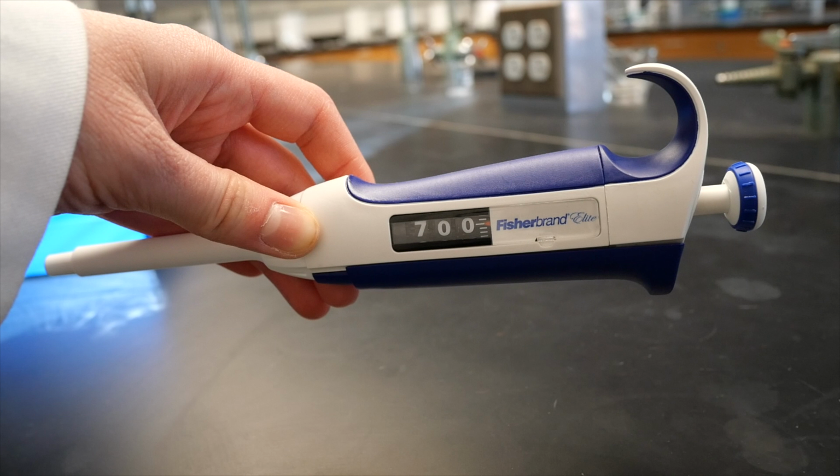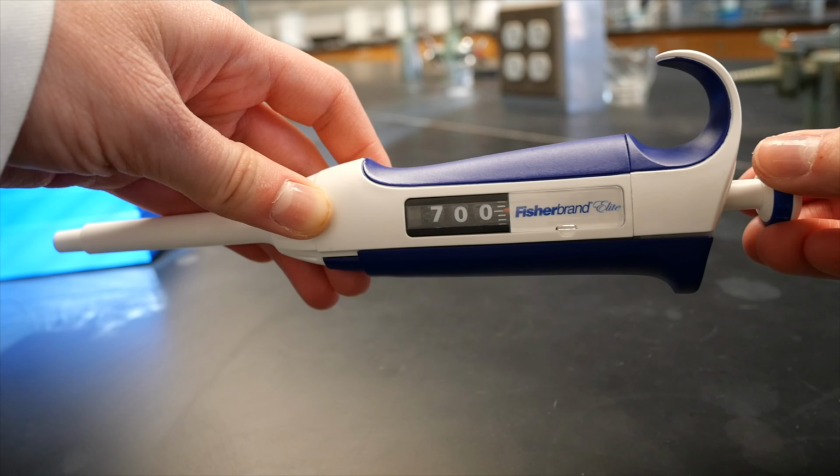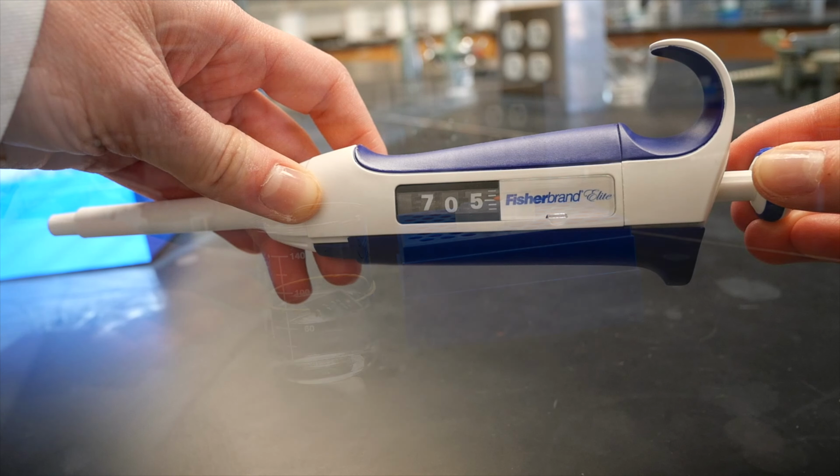So if the pipette is handed to you at a certain volume, you can count with the ticks to figure out your other volumes that you need. So that was 5 ticks, so now we're at 705 microliters.